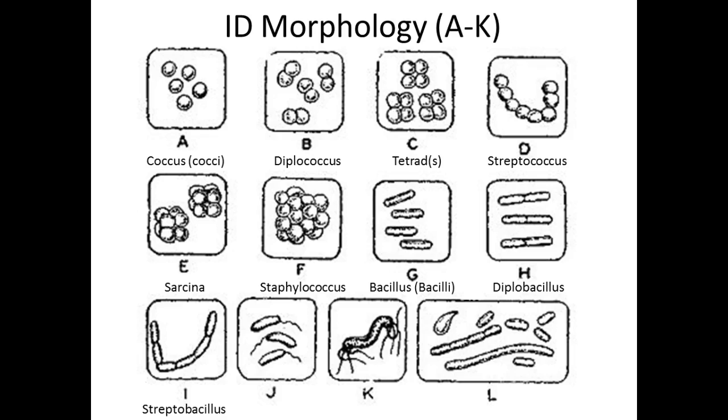These are rods that have a little bit of a curve to them. Even in this picture, they also have a flagella. Vibrio. This one is a rod with multiple curves. Spirillum, or spirilla if there was more than one. And then this is all the same organism in this picture, but no characteristic shape. What is this phenomenon referred to as? Pleomorphism, or being pleomorphic.